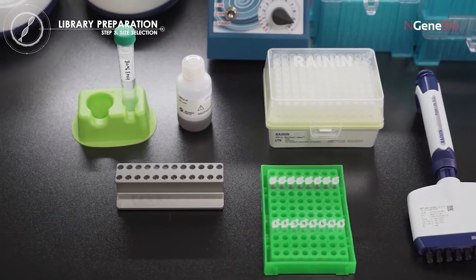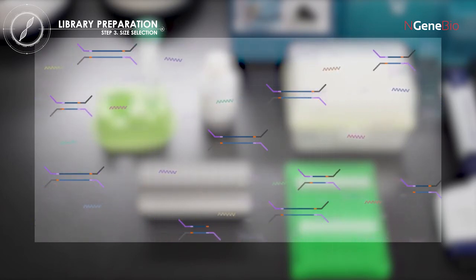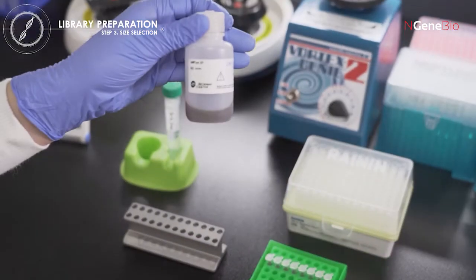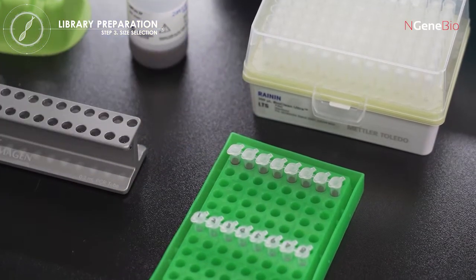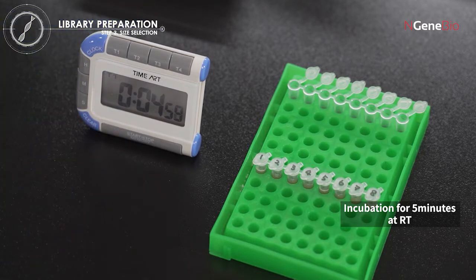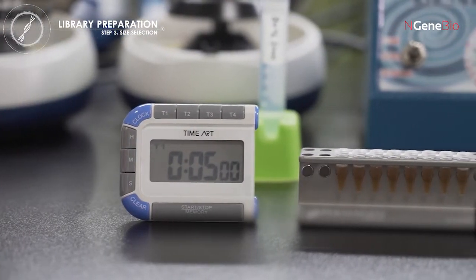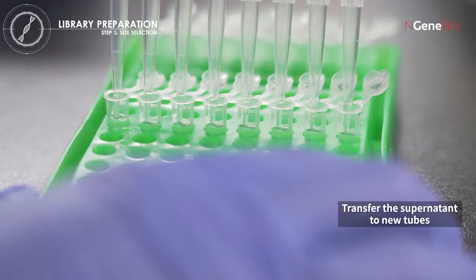To select the desired target size from the DNA fragments, there are two rounds of the selection step. The first round is to remove DNA fragments larger than the desired size, and the second step is to remove DNA fragments smaller than the desired size. Magnetic beads such as Ampure XP beads are required. The beads should be kept at room temperature at least 30 minutes before use. Add 60 microliters of the beads to each ligated reactant. Incubate for 5 minutes at room temperature. Place the tubes on a magnetic stand to separate the beads from the supernatant, and wait until the solution becomes clear, approximately 5 minutes. Carefully transfer the supernatant into a new tube — do not discard the supernatant.